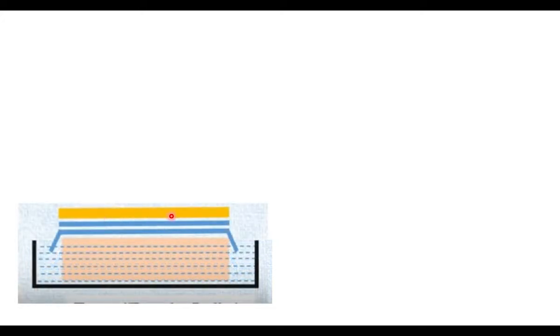So this is the edge of the filter paper. Above the filter paper, what is kept? The gel containing single-stranded DNA fragments. Denatured DNA fragments are on the gel. That gel is kept here. This is the gel. The buffer is drawn upwards by the filter paper, and the buffer passes through the gel. The DNA dissolves in the gel, so the DNA fragments also move upwards as the buffer moves.